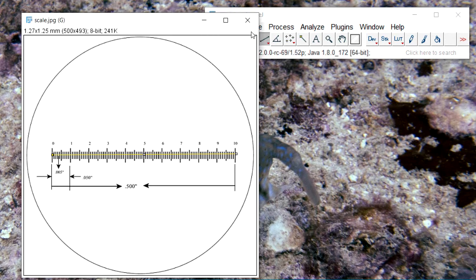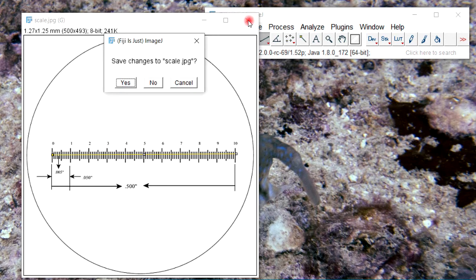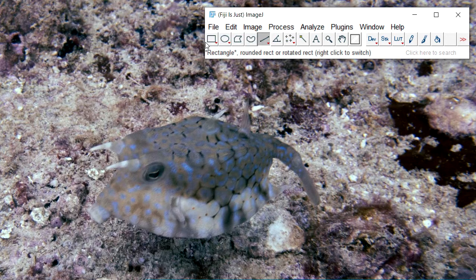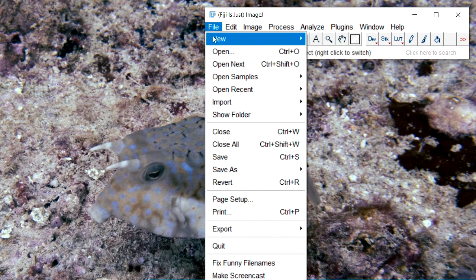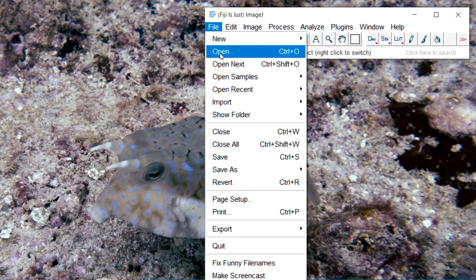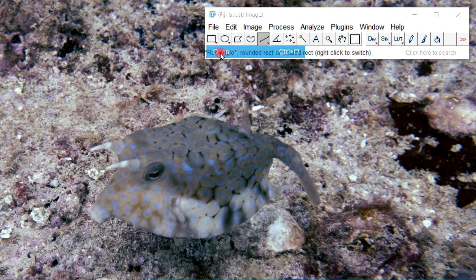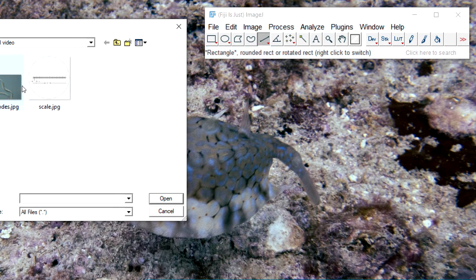Now we are done with this image, so we close it and go to the image we want to measure — in our case, a nematode.